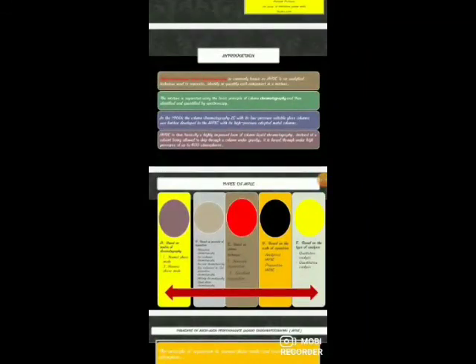Now move further. As we know, the high performance liquid chromatography method was first developed in the early 1960s based on the principle of traditional chromatography techniques, especially column chromatography. Now the technique is based on the pumping of mobile phase through a packed column under high pressure. Hence it is called high pressure liquid chromatography.